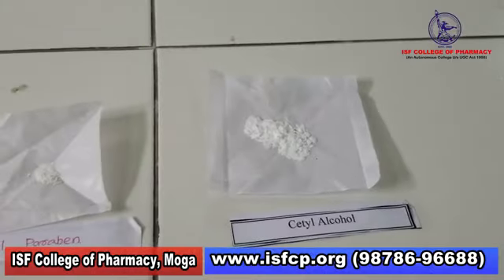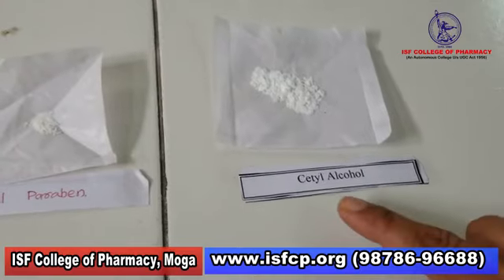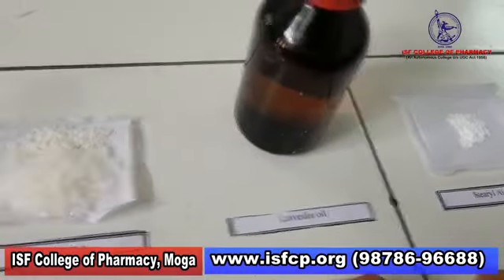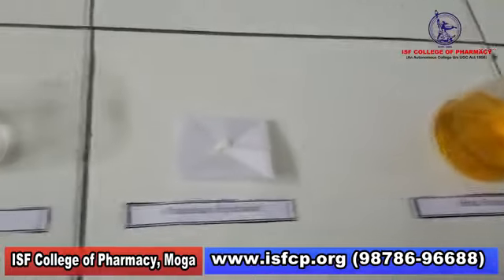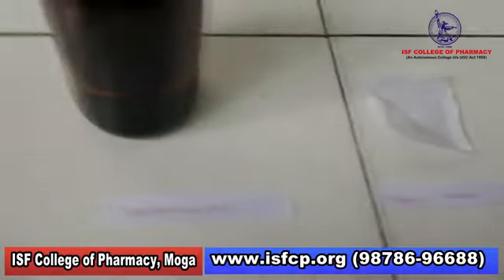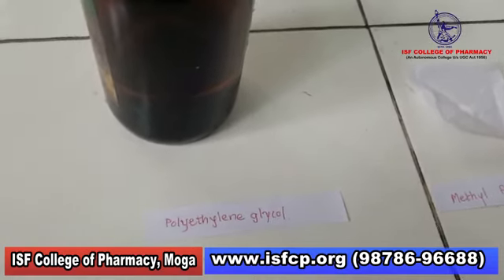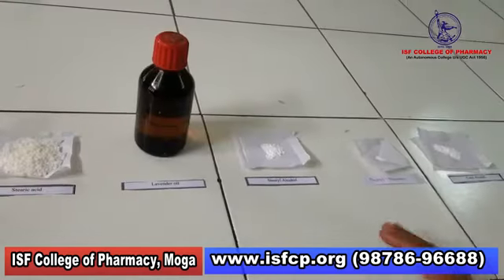To start the all-purpose herbal cream, we'll take the ingredients: cetyl alcohol, propyl paraben, stearyl alcohol, lavender oil, stearic acid, curcumin herbal extract, potassium hydroxide, glycerine, methyl paraben and polyethylene glycol. These ingredients are used in the composition given in the table in order to make 100 gram of the cream. All ingredients are ready with us.